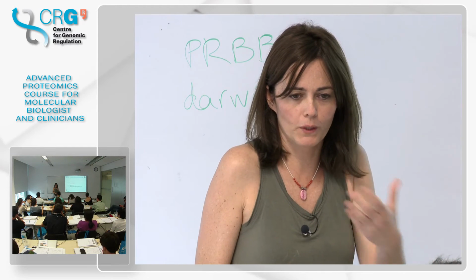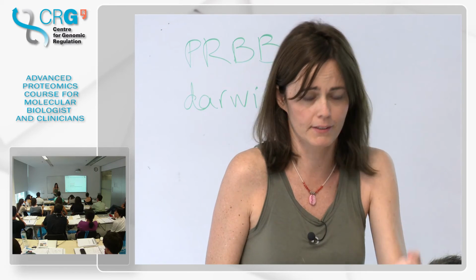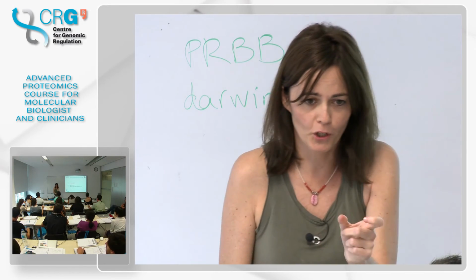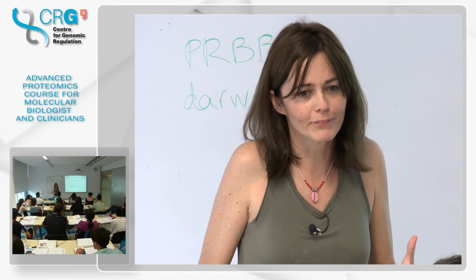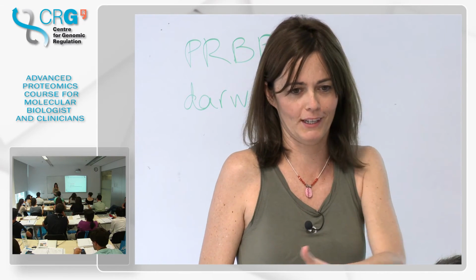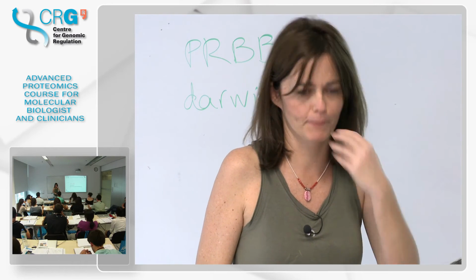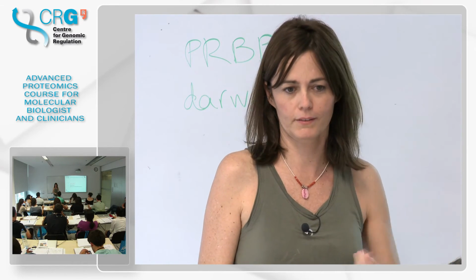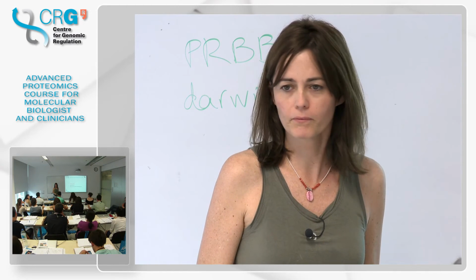Of course, we can always use our previous knowledge. Sometimes because we know that the kinase have certain motif, like serine proline. Maybe we don't have the ion, but we know that that's what the kinase is looking for. And then we can use this other knowledge, but by mass spectrometry, we cannot always assign the correct site.